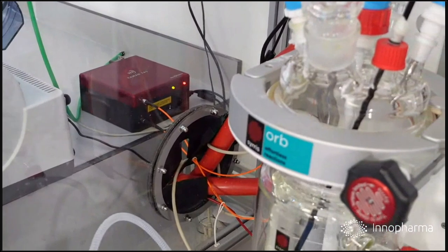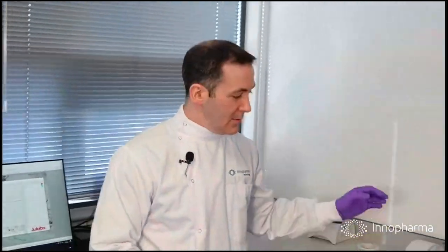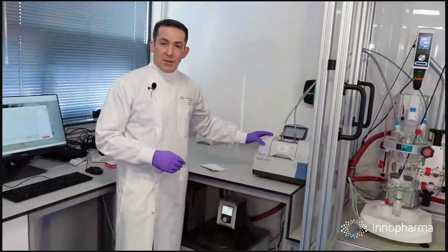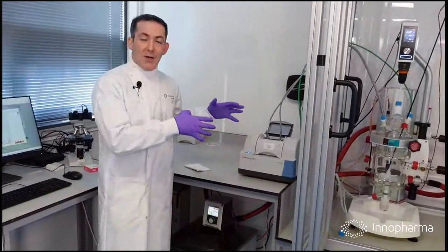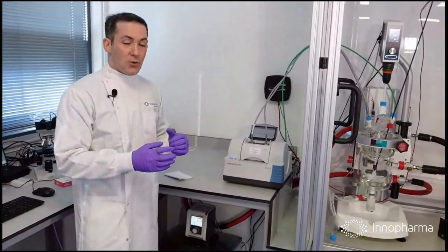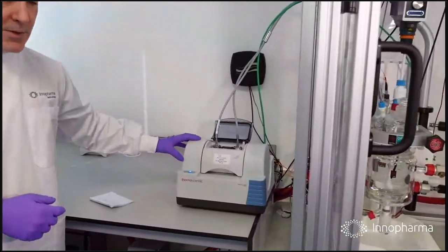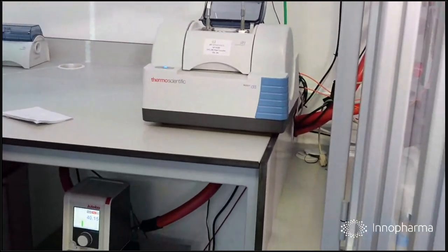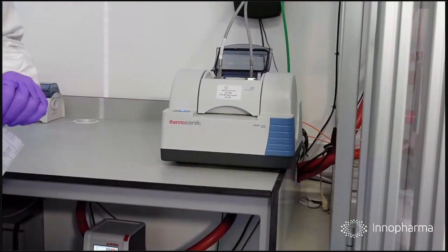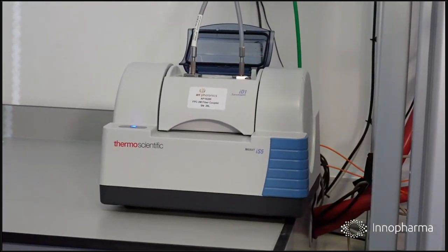I'll discuss this in a moment, but in the case of both the Raman and the Fourier transform infrared spectroscopy, recent developments in fiber optics mean that we can now see inside our processes in line and in real time. We have a bit of legwork to do to interpret the signals, but that's what we're going to talk about today. These are recent developments in which we can use an instrument like this, attached via fiber optics, to see inside the process as it's happening. Similarly, that's also true with the Raman spectroscopy and the near-infrared spectroscopy methods, although that's a slightly more mature technology.